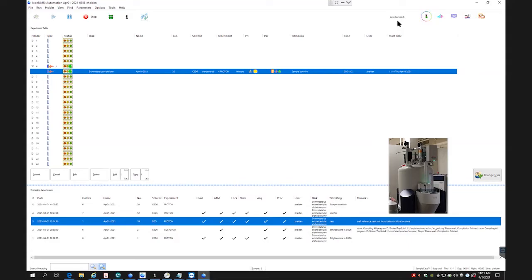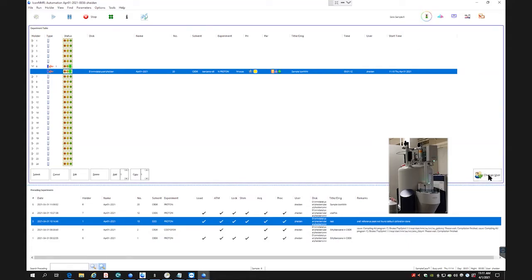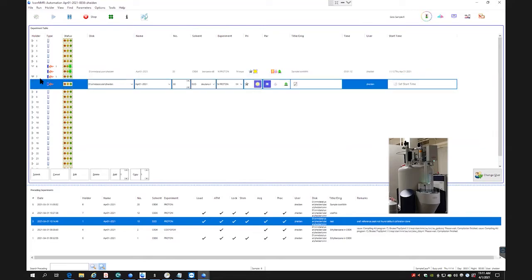At this point, if you're done submitting all of your samples, you can just click on change user. If you say you have a sample in 7 and we want to add an additional sample, you can click on that and add that in here. It automatically makes it 30. You can say, all right, this is proton, deuterium oxide was your sample here.